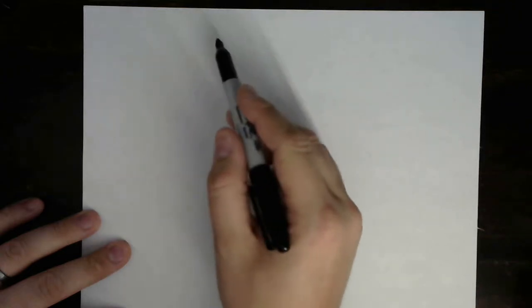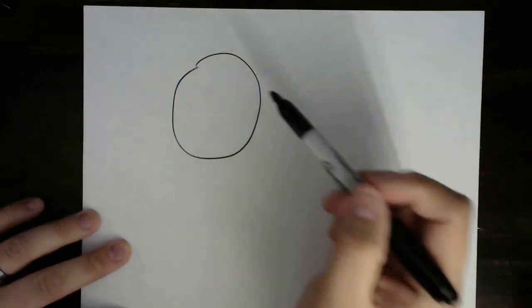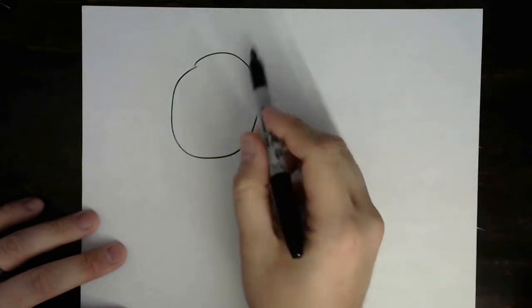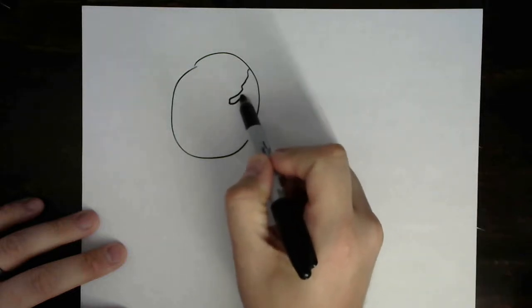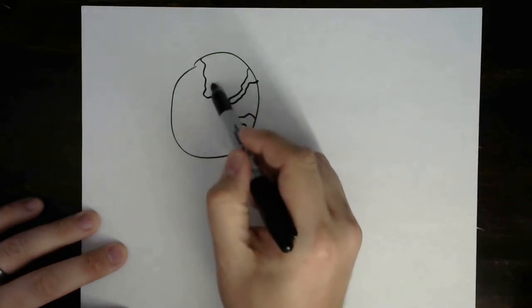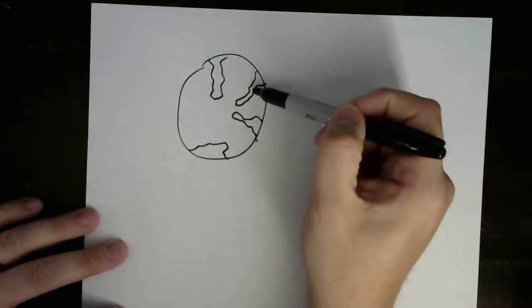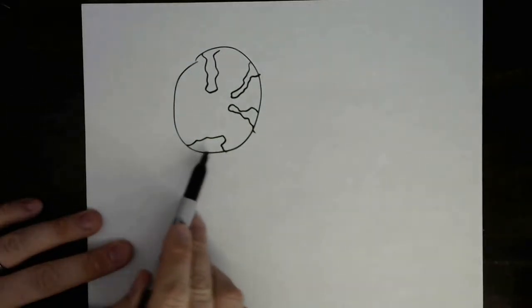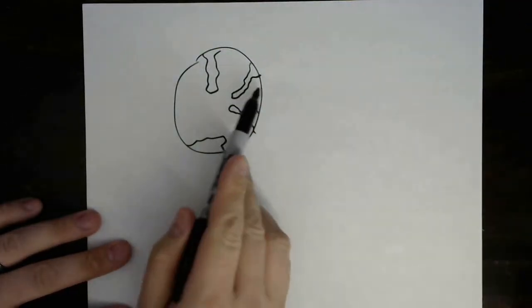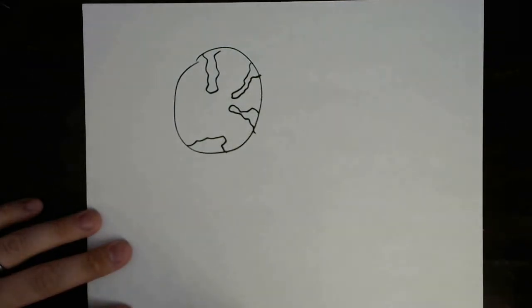But the concept is this. You have a stationary phase particle. We're going to draw just one of them. And these things are not usually solid spheres like I've drawn this. They're usually porous, right? So they have these pores. I'll draw them like crags going deep into the depths of this particle. And you can see that these pores have various different sizes, right? Some of them have big openings. Some of them have relatively smaller openings. There are these narrow constrictions that can be present in the middle there that prevent things from getting past.